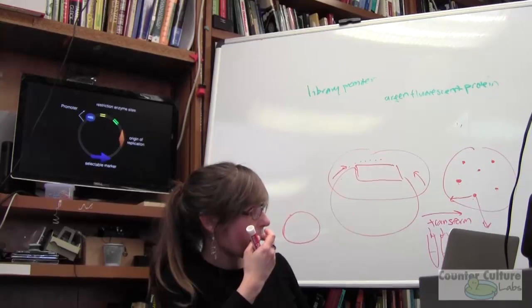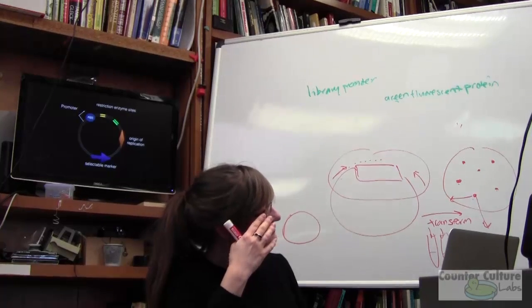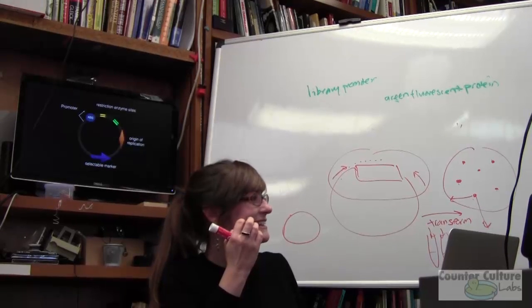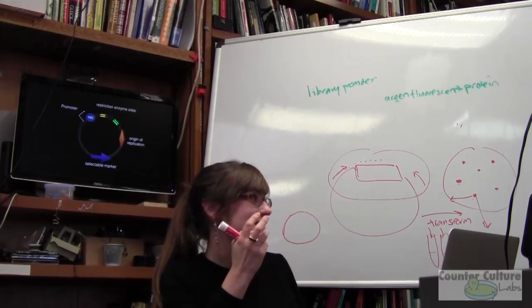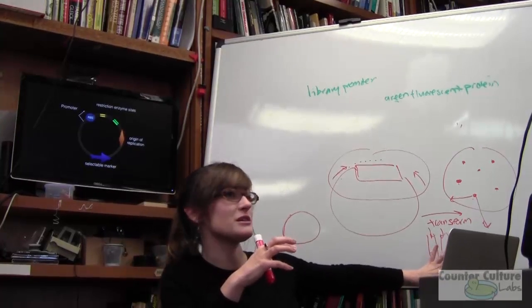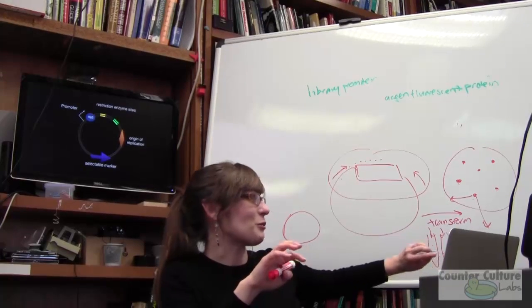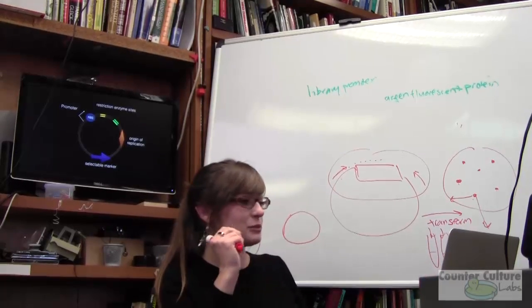Can we isolate this DNA the same way we isolated our DNA from our spit with alcohol? It's very similar. Yeah, the steps are similar. Except you won't be able to roll it up on a toothpick. Little circles. But it's not as clean. You won't get nice pure DNA. And actually for E. coli or any organism, there's a separate genomic DNA extraction versus plasmid DNA. A mini prep specifically gets rid of your genomic DNA, in theory almost all of it, so that you're only left with your plasmid DNA and not the genomic.